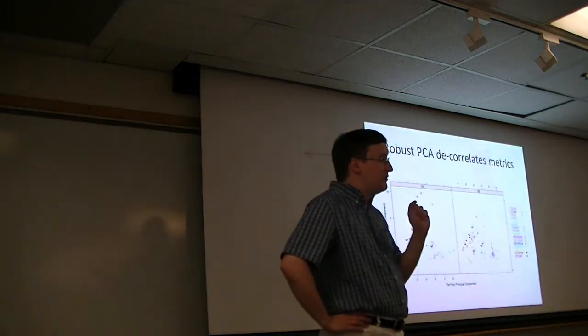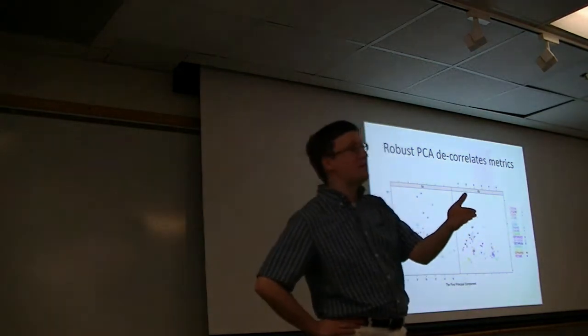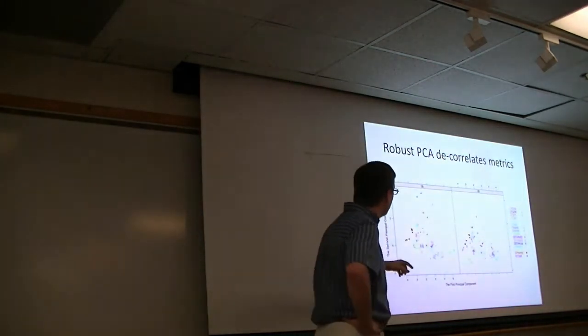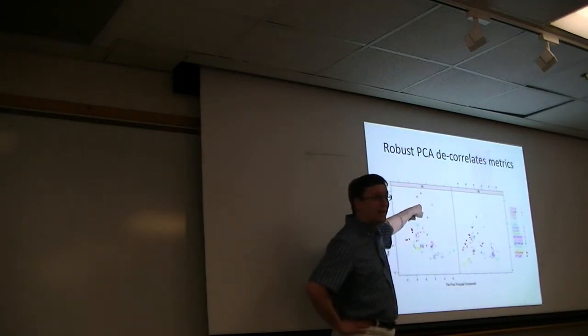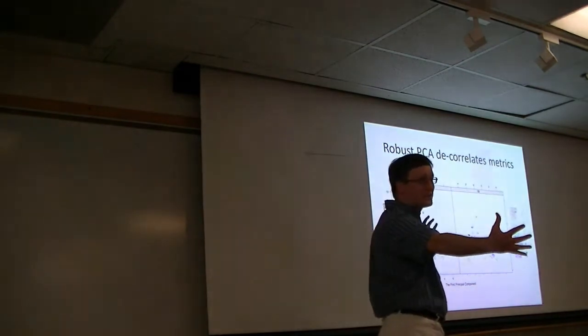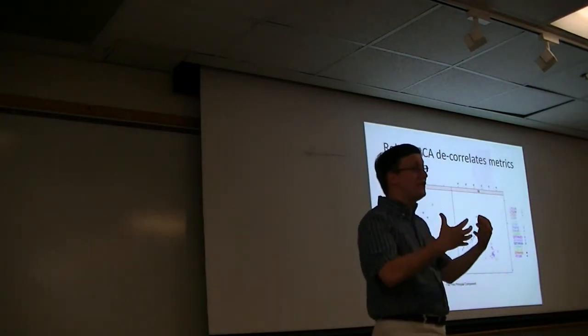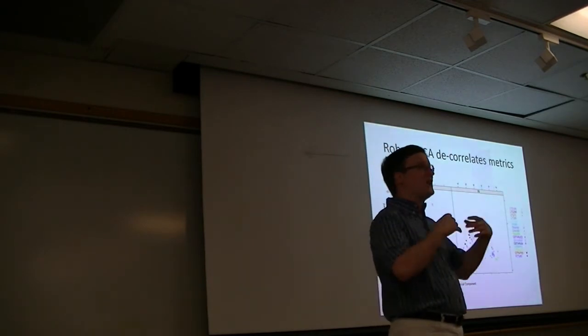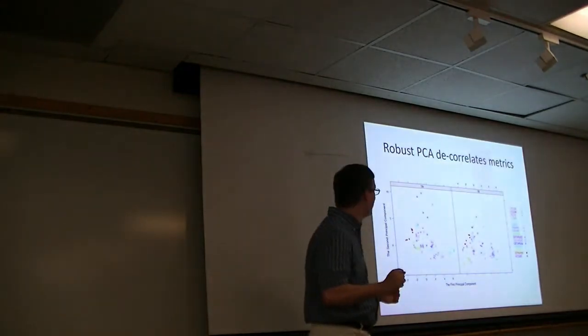But I would point out that principal component analysis, if given 40 metrics, will give you 40 components back. And it may be that even though blue window panes looks really bad in terms of variability here, if we look at it in 40-dimensional space, they might have a very good grouping. So what this means essentially is that their variability is not the variability that we see across the entire experiment. That's what we can conclude.